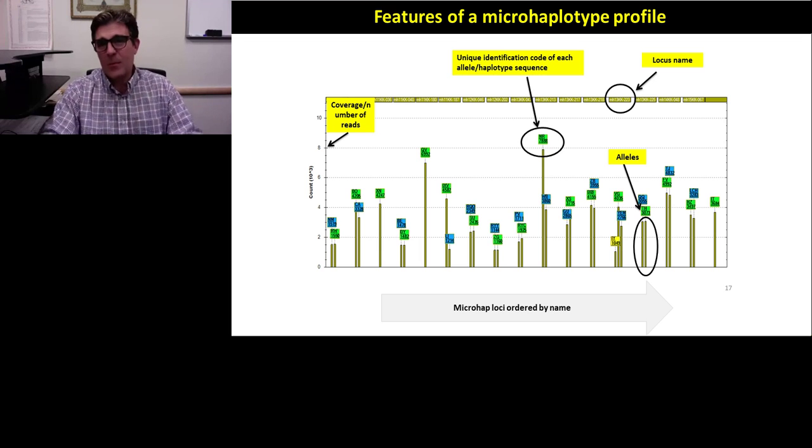visualize the sample. And it's attractive to old school DNA analysts that are used to looking at peaks, right? The bioinformatician doesn't really look at this anymore. So this is really for us molecular biologists or DNA analysts.